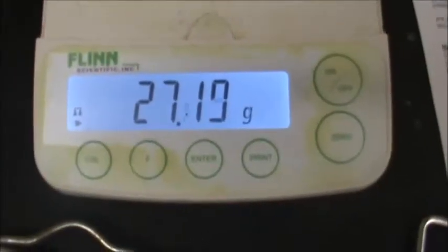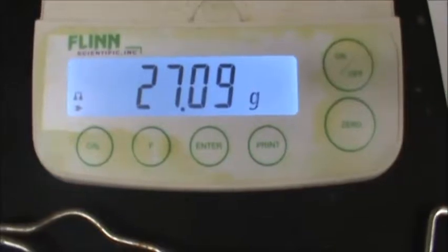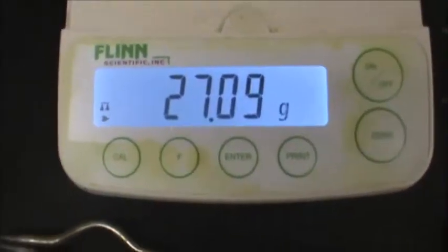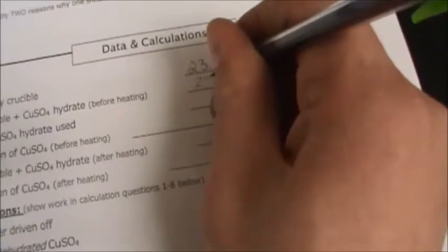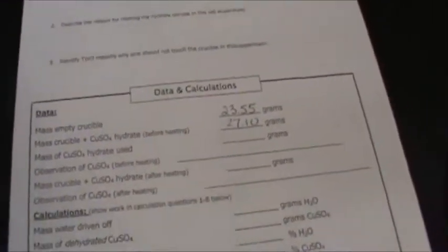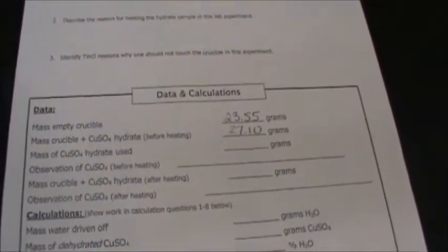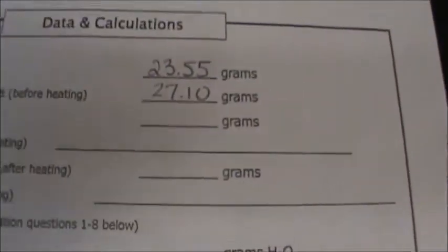All right, whoops. I measured out 27.09 grams, so I'm a little bit beyond the 26.55, but that's okay. I'm going to now record my 27.10 grams into my data table, and now I'm going to find the mass of my copper 2 sulfate hydrate used. I just have to do a little subtraction. I'm hoping that you can figure that one out on your own.